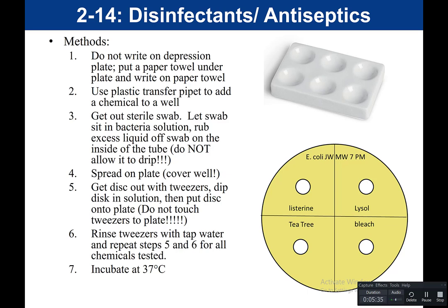Then use your tweezers and take your sterile disc and add it to the appropriate chemical. Dip it in the Listerine, then take that disc and add it to the plate. Make sure you don't touch the forceps or tweezers to the plate, because the plate has bacteria and we don't want to contaminate the forceps. Just drop the disc onto the plate and let it sit. In between chemicals, rinse the tweezers with tap water and repeat.